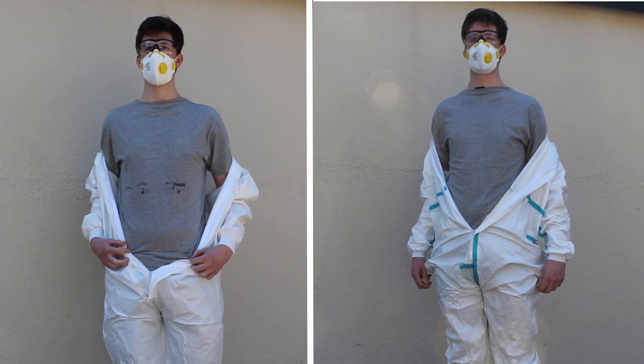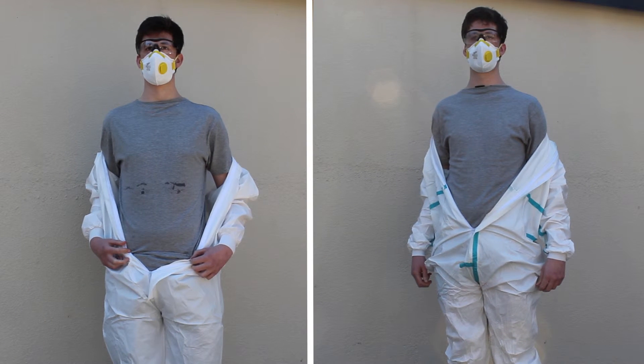Please note: this video demonstrates the effectiveness of Optimum coveralls and does not validate the use as demonstrated in this video. The ISO standards that our garments comply to are for limited spray or splash protection. Also note that the tests shown in this video are much more extreme than the intended use of the garment.